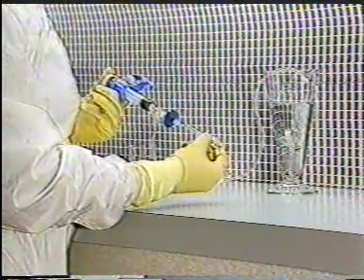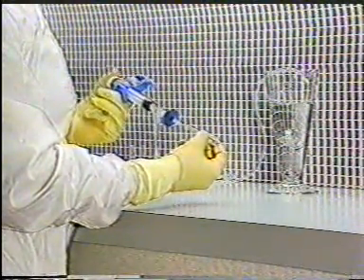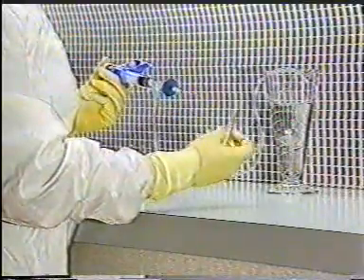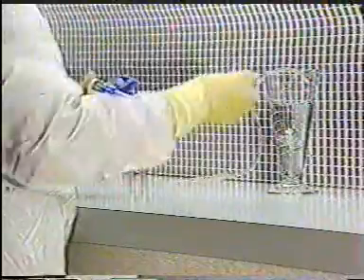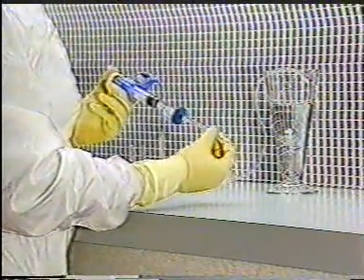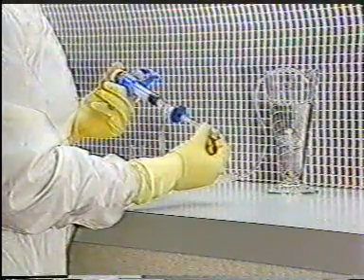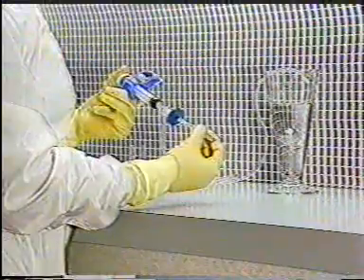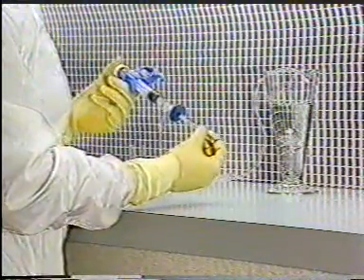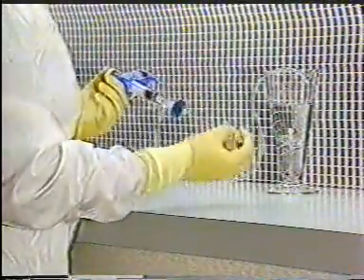There are several types of filling machines for sterile products. They range from a filling capacity of less than 1 ml to up to 1,000 ml. Selection is made on the basis of the volume to be packed. For small quantities, a repeat dose syringe may be used. This syringe has a one-way valve through which the solution is drawn from the reservoir into the syringe barrel. When the plunger is pressed, the measured volume is expelled via the tip of the syringe.